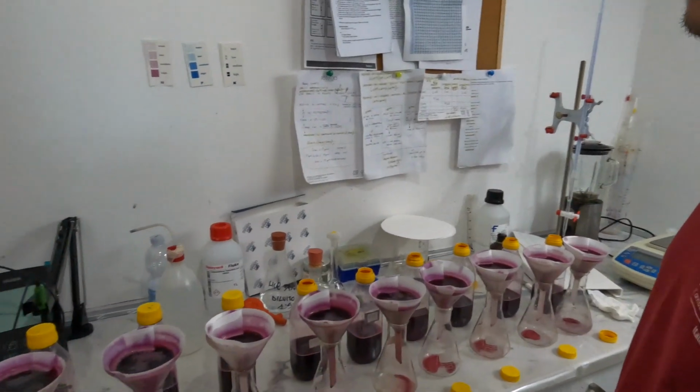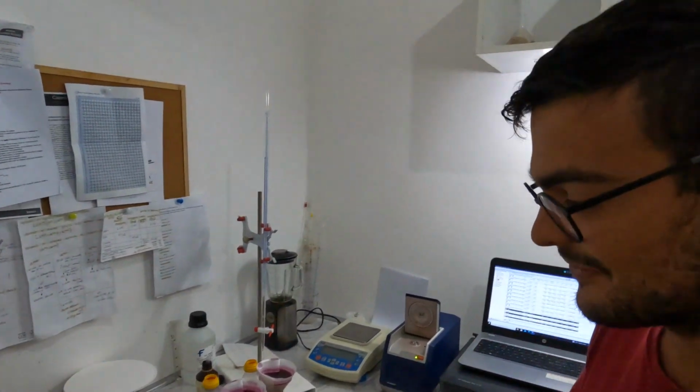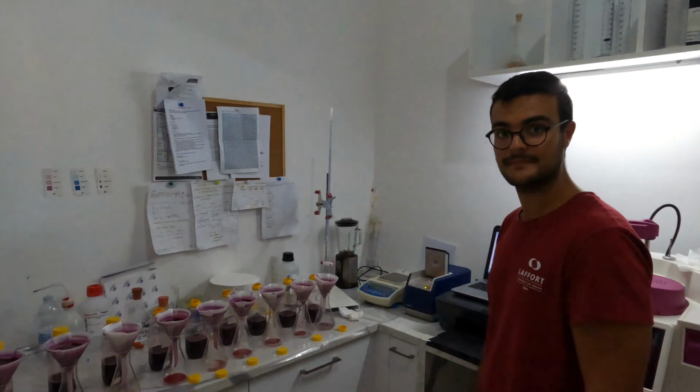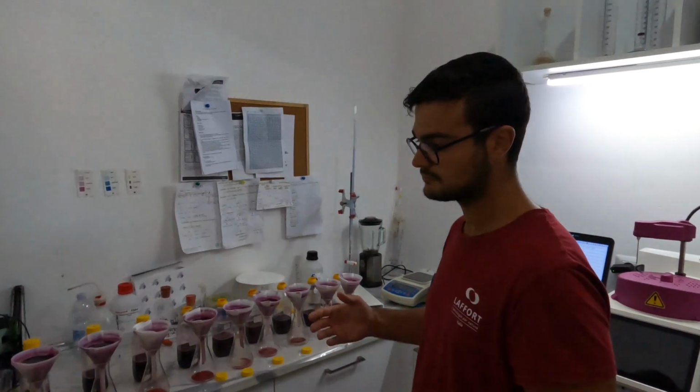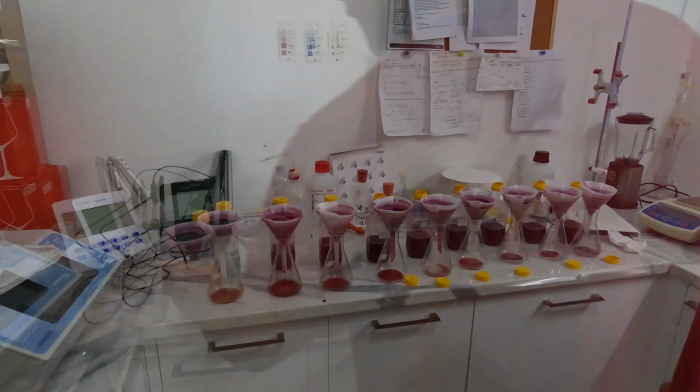Okay. On different days we have a different situation in different tanks. Fermentation lasts about 8-10 days. Nice. Okay. All right.